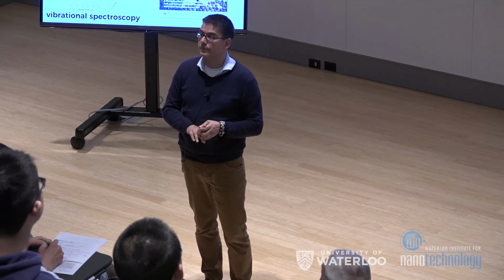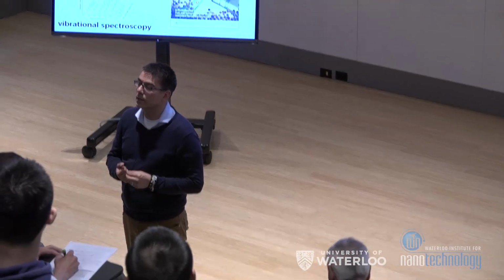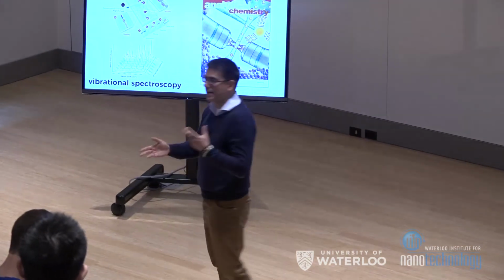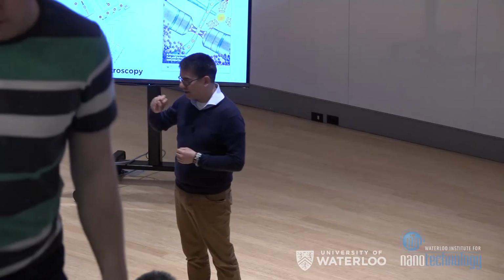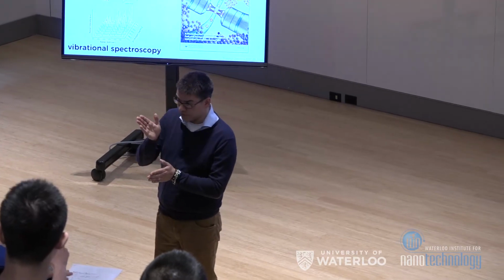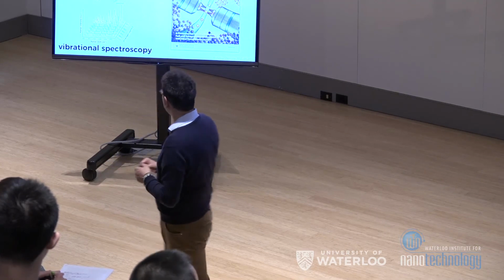Very nice work. Could you comment on how you recover your product after you've done the reaction in the droplet phase? How do we recover the product? It depends what we do. So again, we're an academic group, so we're typically not making things in large quantities, but in a lot of the systems that we use, say for doing the nanomaterial synthesis, you just break the emulsion afterwards. You separate the two phases and pull them out.